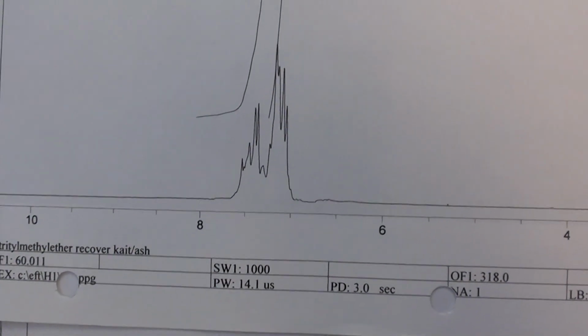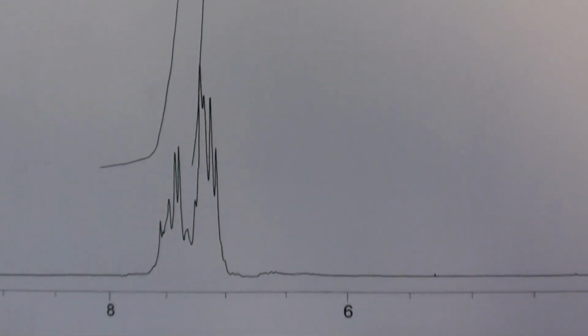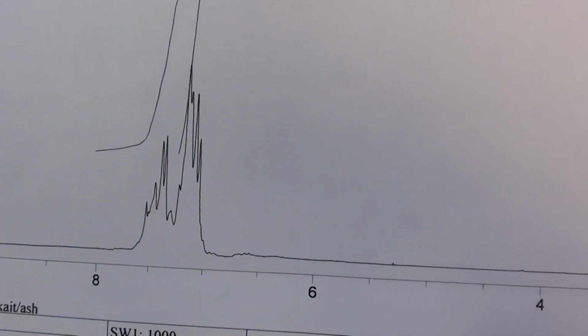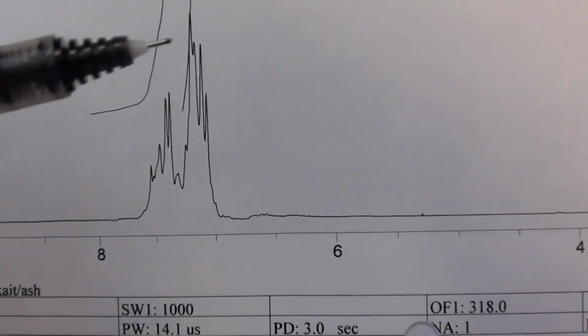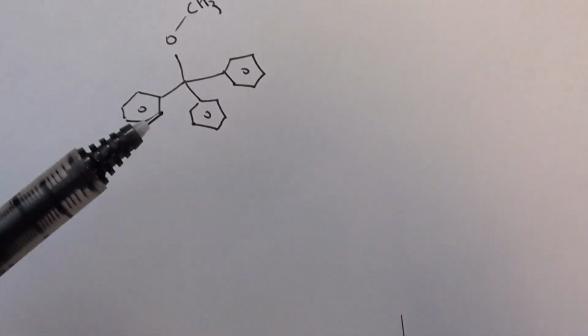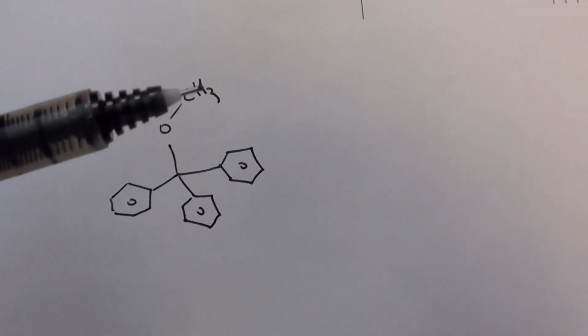When I got a proton, Caitlin and Ashley, their proton came out reasonably pure. And the only reason why I know that is you don't see that characteristic giant singlet of the starting material. You don't see really any benzophenone left over. So this right here is pretty nice. This is exactly what you would expect. And again, can we definitively label the two humps? Not really. We can just circle this and say it's all of your aromatic hydrogens. And then, of course, the singlet for the O-methyl.